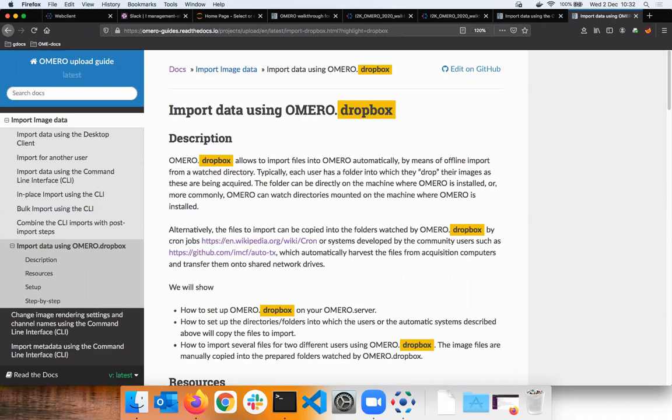I mean our Dropbox. Forget the Dropbox with a capital D, just throw it out of your mind now. This is not what we are talking about, okay? So it would be possible for our users to have a box, which is the place where they put their data, and then the in-place import is automatically generated whenever they add something. Yes, that is possible. You can watch my screen and you can mock what I did.